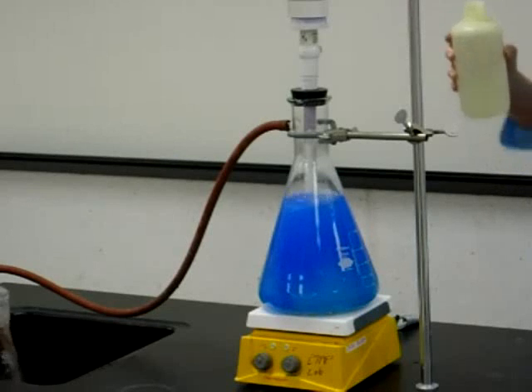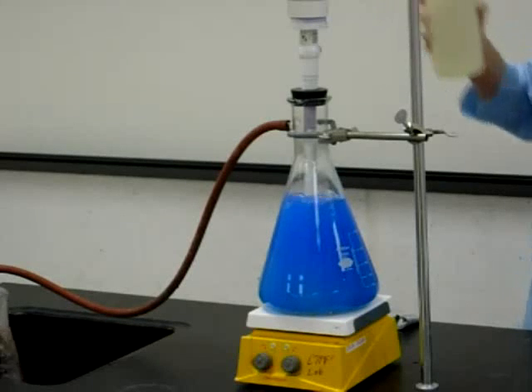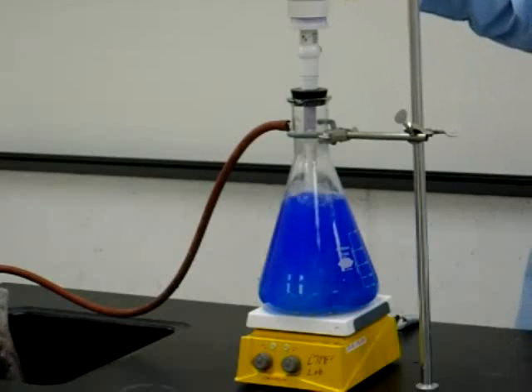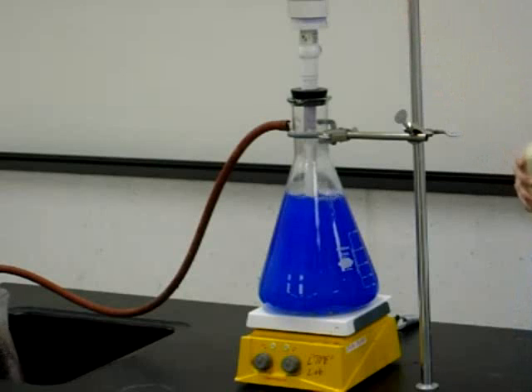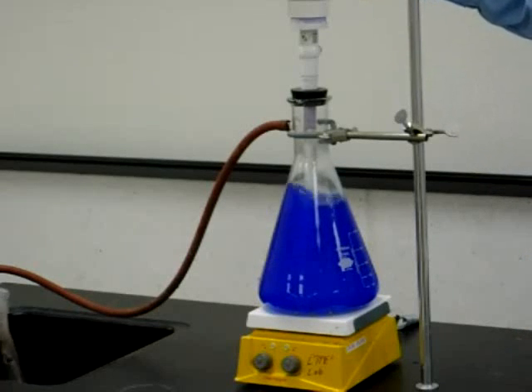And then with the addition of yet more ammonia, another complex of copper is produced, a complex of copper and ammonia, and the solution becomes clear again. This final form of copper is soluble in water.